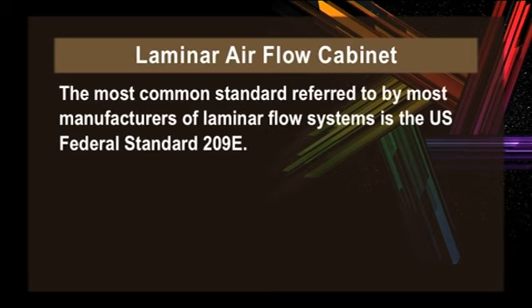The most common standard referred to by most manufacturers of laminar airflow systems is the US federal standard, that is 209E.